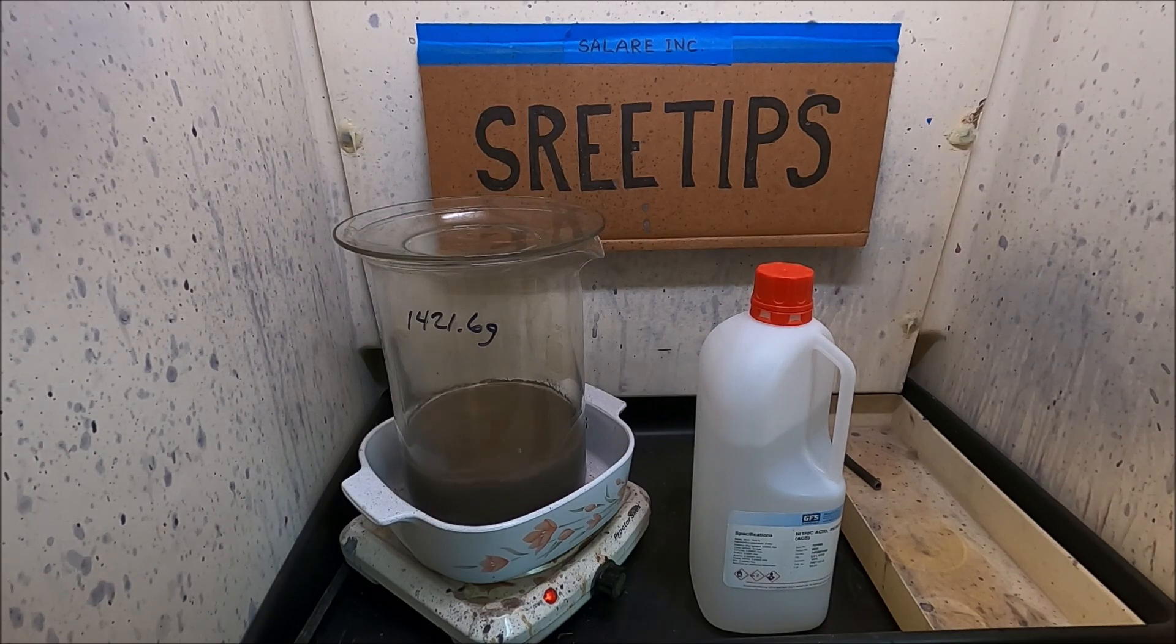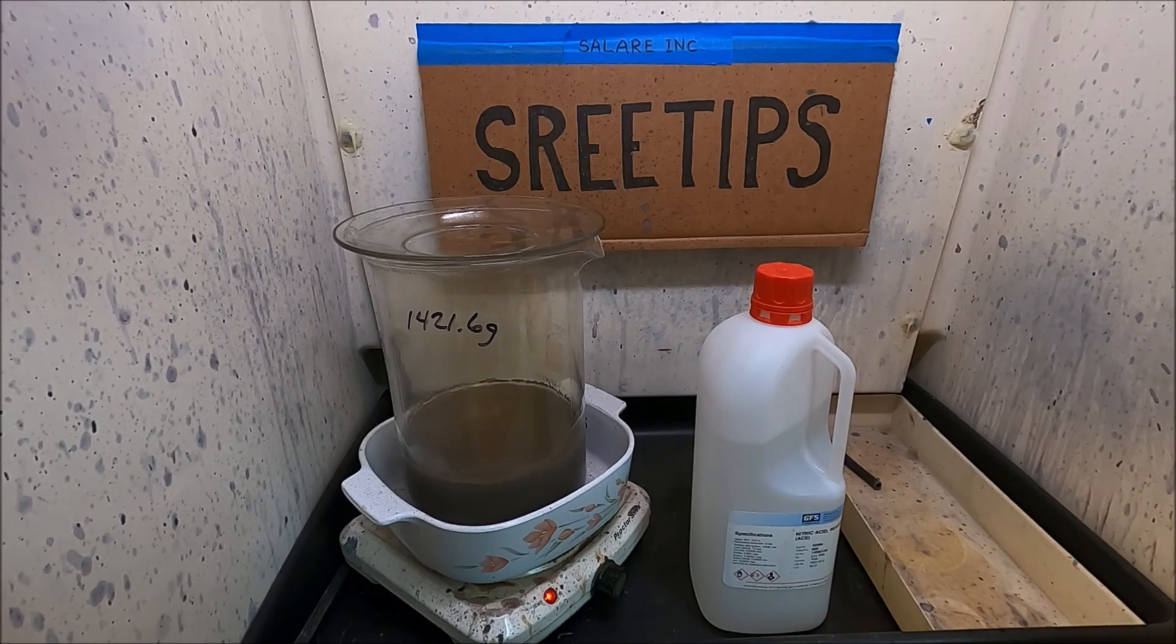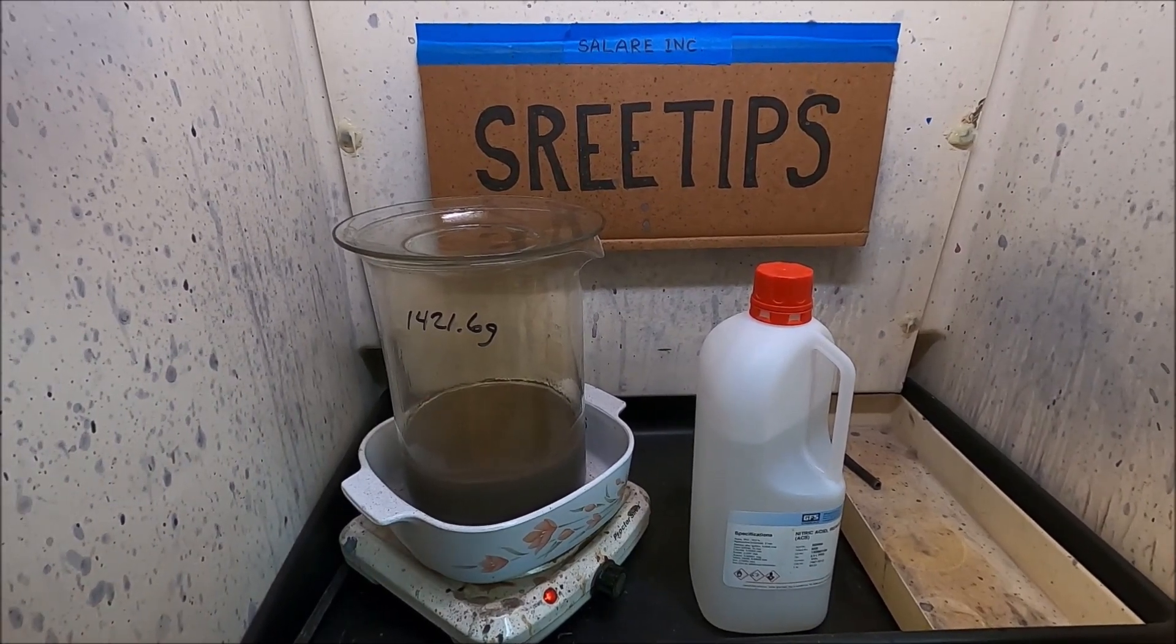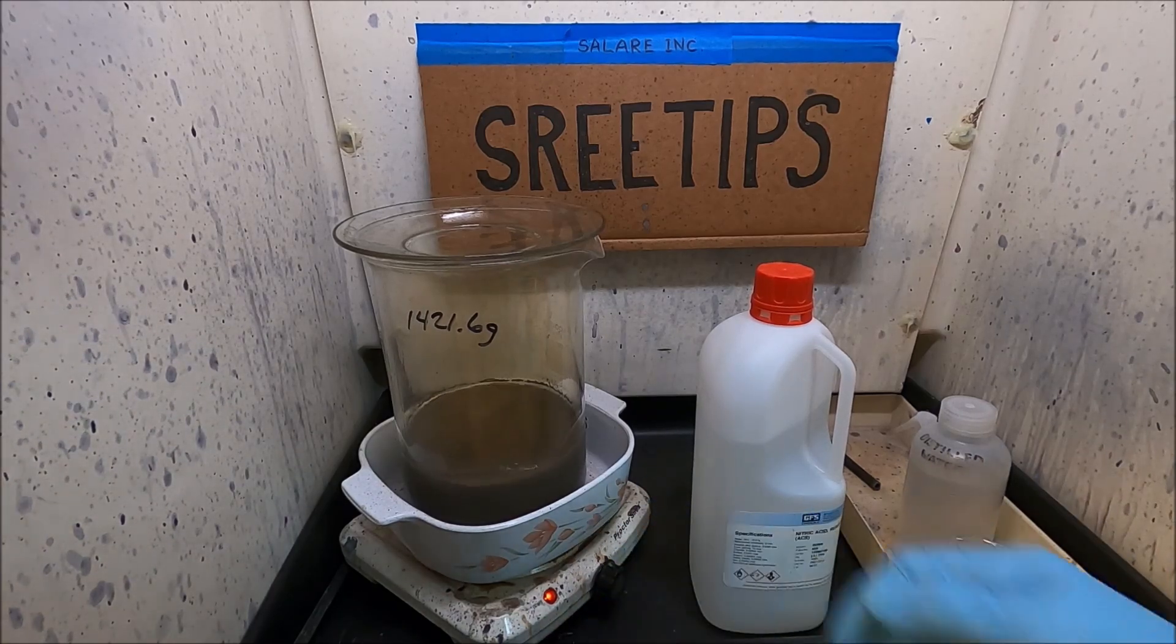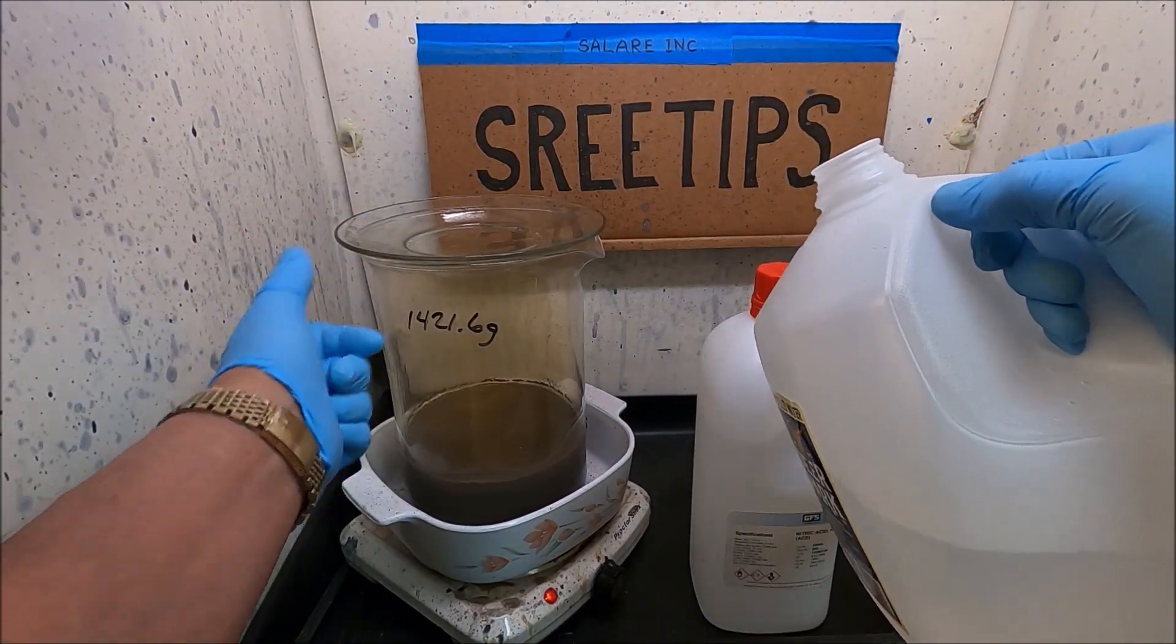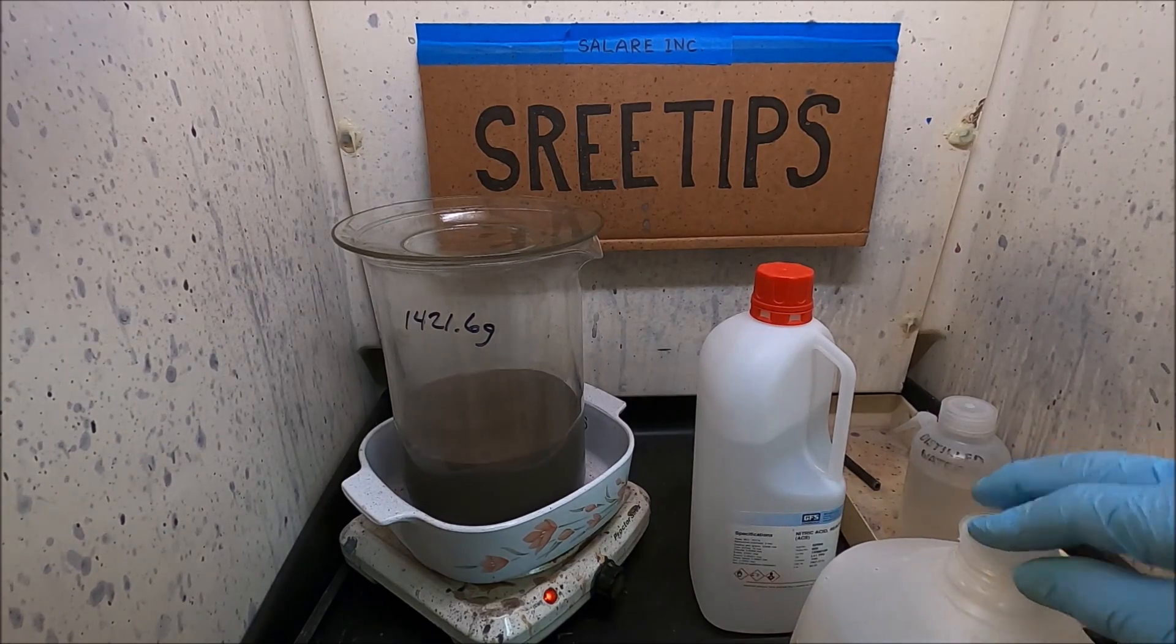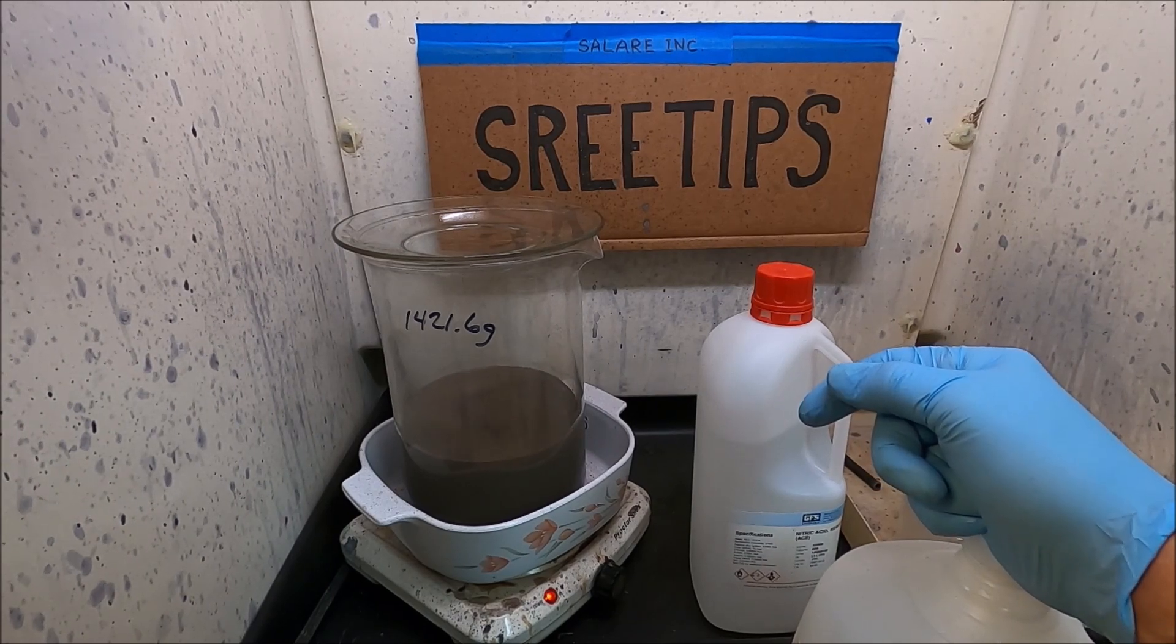OK, I think it's safe to conclude we've got all the stuff that's going to dissolve in nitric dissolved out of our material now. Go ahead and turn the heat off. I'm going to add some distilled water to dilute everything down in here, and we're going to let this settle out. And then we'll get the solution off our material, rinse it out real good, and then hit it with some aqua regia.